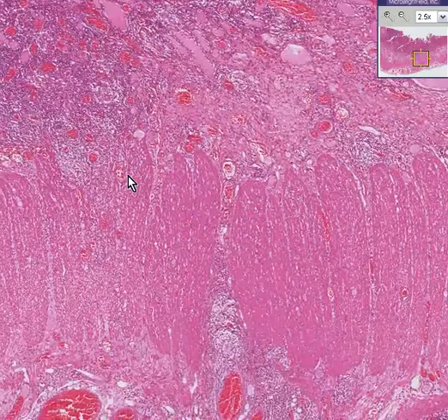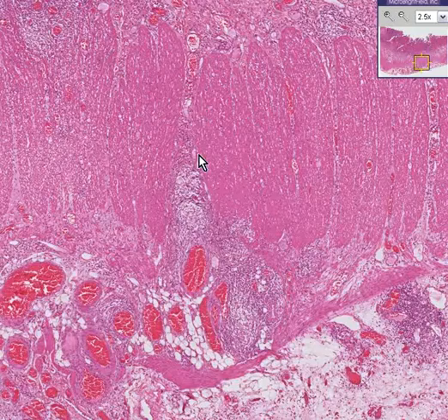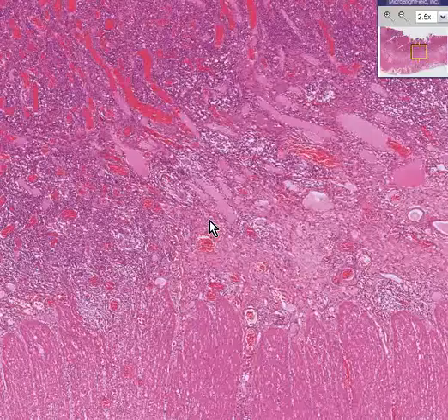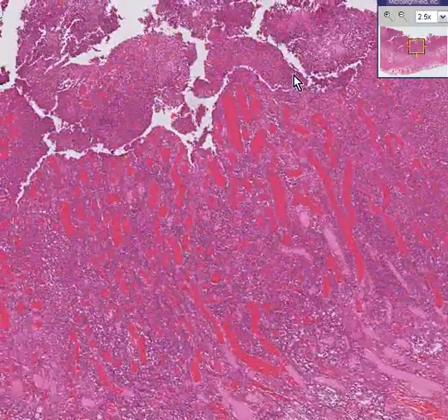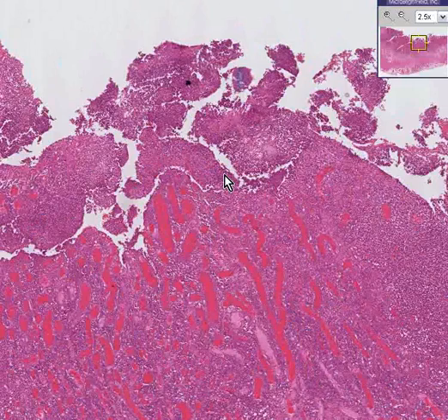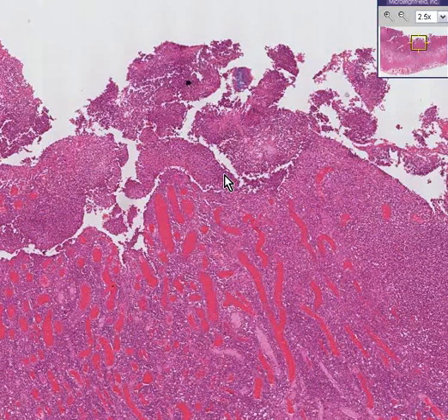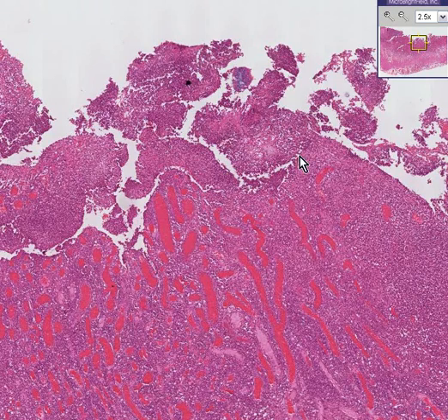The affected layers include the mucosa, submucosa, muscularis, and adventitia. Another nice finding to look for are granulomas. If you see granulomas, this is almost entirely indicative of Crohn's disease, which is also why Crohn's disease is called granulomatous colitis.